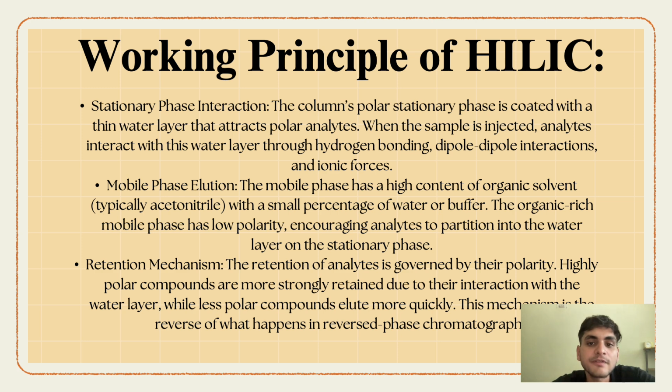The working principle of HILIC. Stationary phase interaction. The column's polar stationary phase is coated with a thin water layer that attracts polar analytes. When the sample is injected, analytes interact with the water layer through hydrogen bonding, dipole-dipole interaction, and ionic forces.